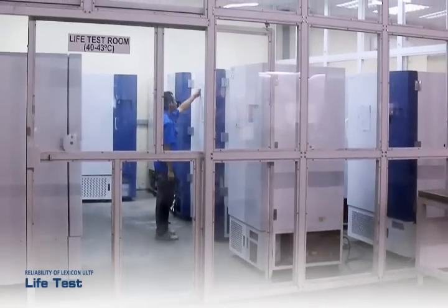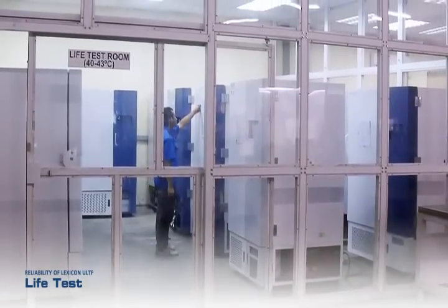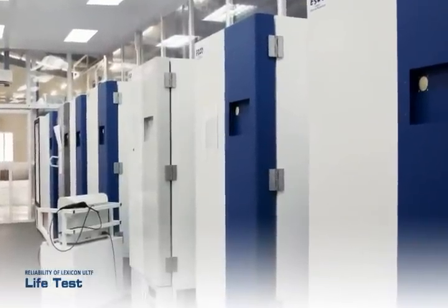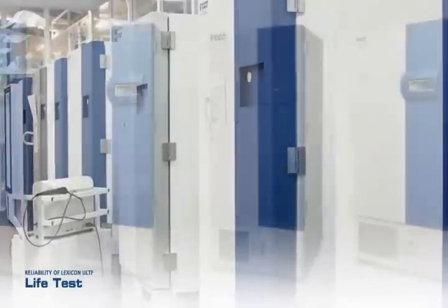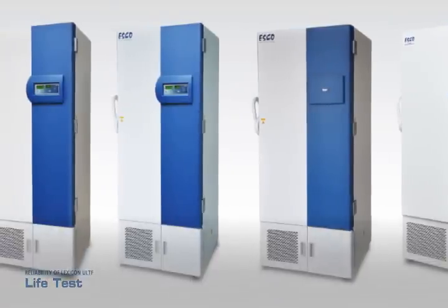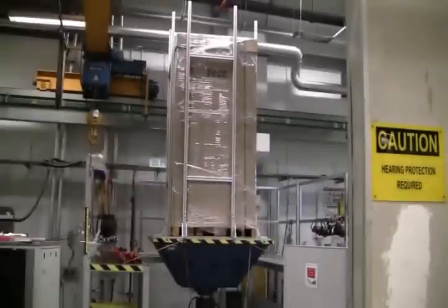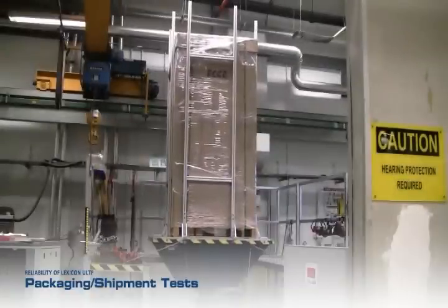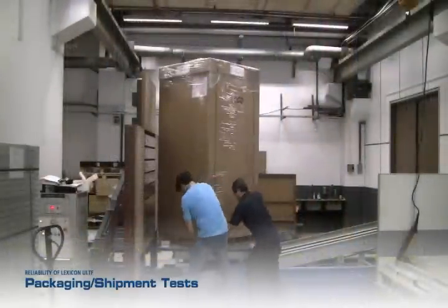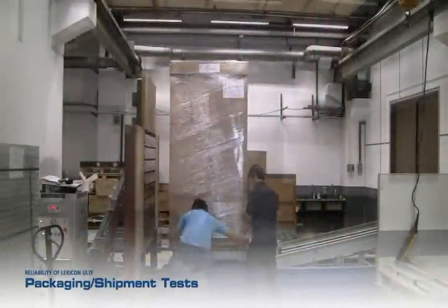In total, 34 units have undergone life tests at 40 to 43 degrees Celsius in a controlled room for at least 6 months to ensure reliability of the ESCO ULT Freezer. Packaging reliability tests have been performed according to ISTA-2B standard to ensure that the product can withstand rough-handling conditions.